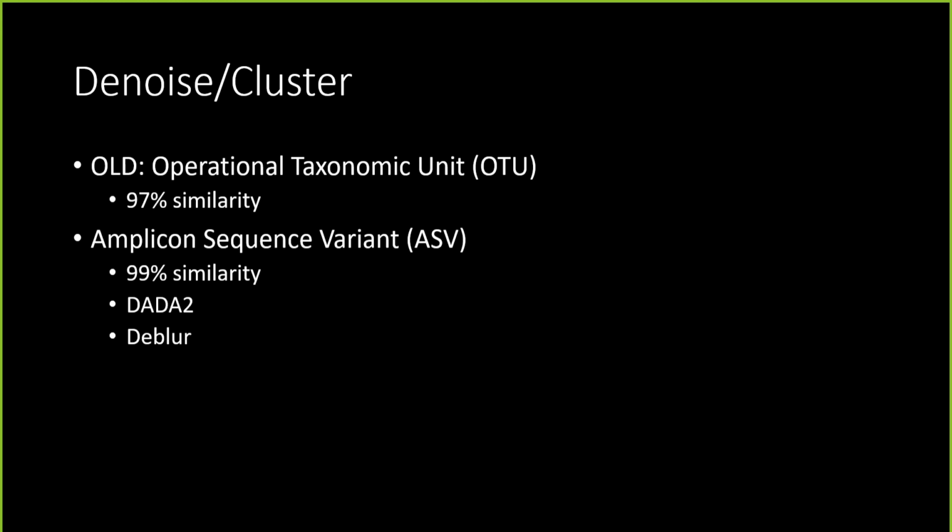They had some samples where they were looking at microbial DNA from vaginal samples, and this is usually an area that is super, what's the opposite of low diversity, so there's usually only one genus of bacteria in these samples. And by using these amplicon sequence variants and the DADA2 package, they were actually able to find that, oh, there's actually some minor variation in the sequences from these samples, and they found 6 different groups which might be of interest for future studies. So going up to 99% similarity is going to be better and help you tease apart some really minor differences.